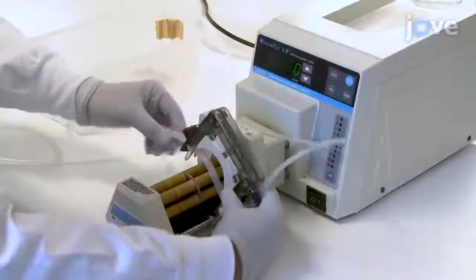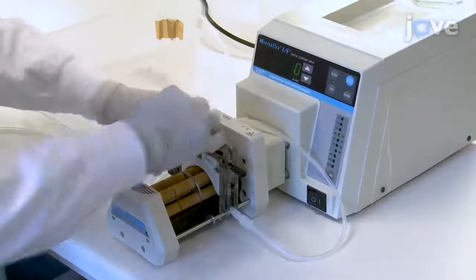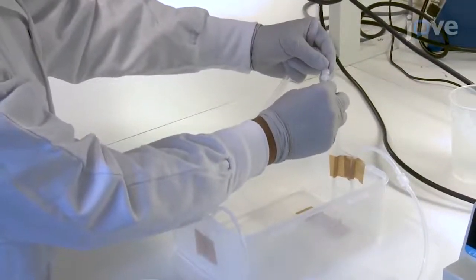Now, place tube F into the cassette of the peristaltic pump. Take another tube C and connect one end to the vein's outlet.